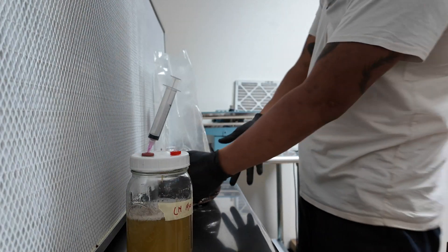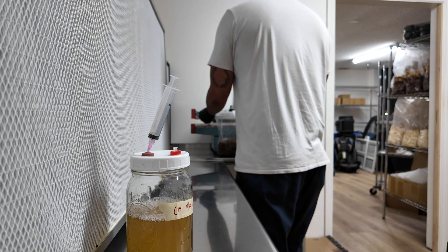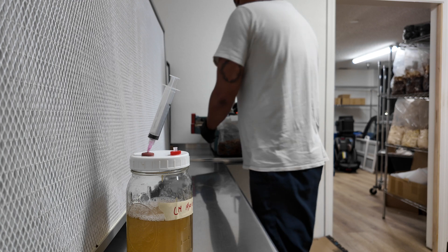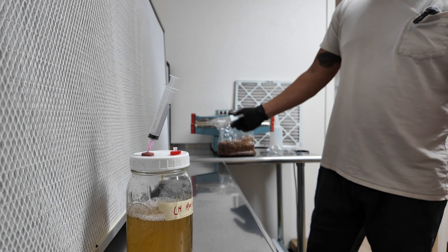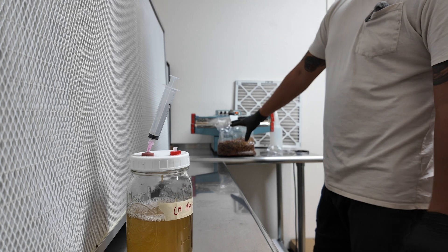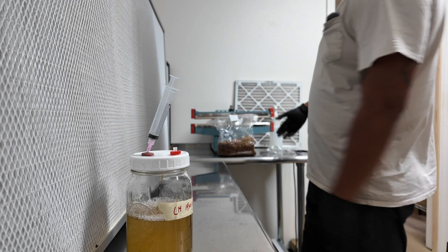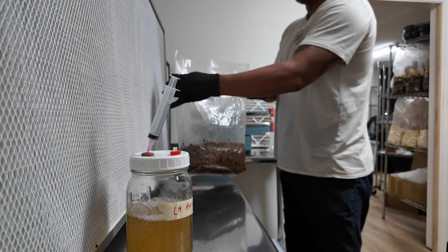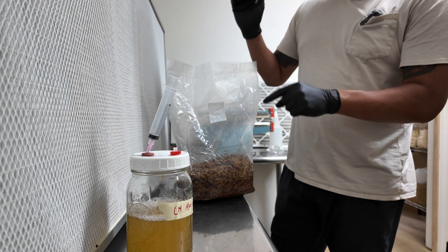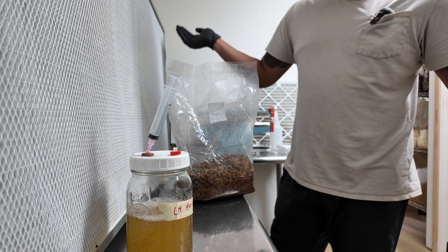Then we seal the bag. Unlike generation 2 where we had to mix up all our grain spawn, we don't mix this — we just squirt the liquid culture in, seal it, and it's done. That's a generation 1 grain spawn bag: liquid culture to grain. We put this on the shelf and that's it.